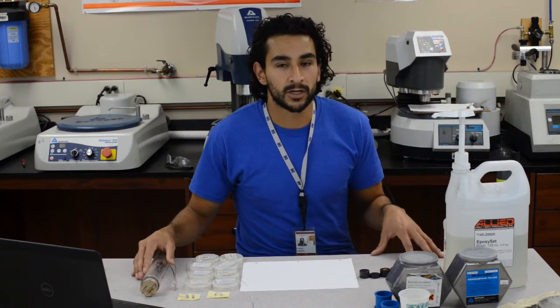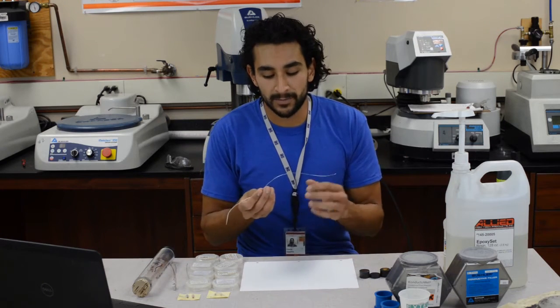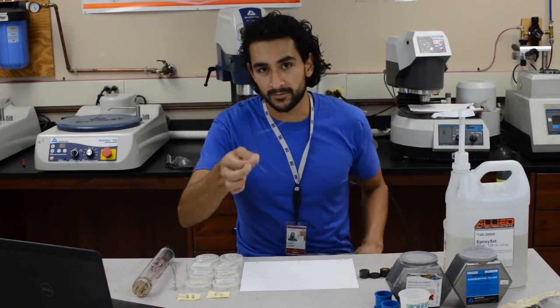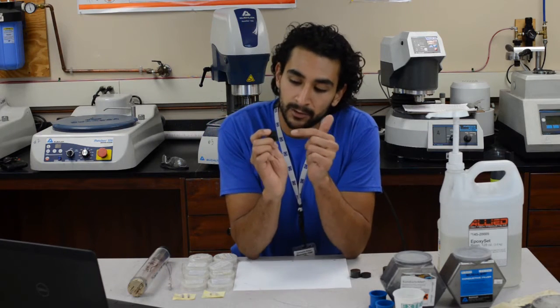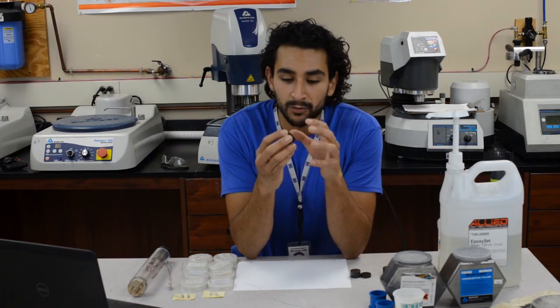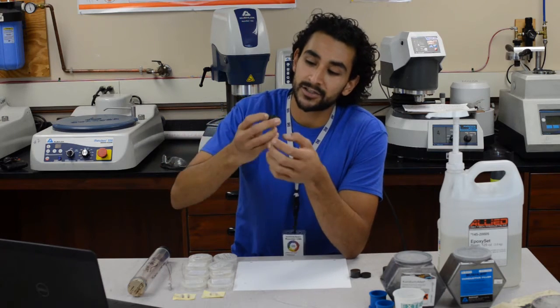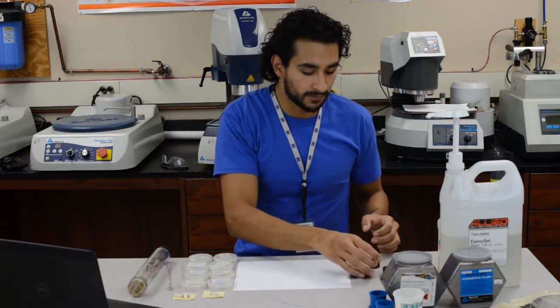A sample is literally any physical object that has been prepared to perform a particular study. In our case, in this laboratory, we work mostly with superconductors. Therefore, your samples will very often be made of metals, most likely always metals, and very often in the form of a wire like this one right here. And these are metallographic pucks — your sample inside a thermoset polymer, which holds everything in place so you can grind and polish it to get a nice cross-section of your sample.